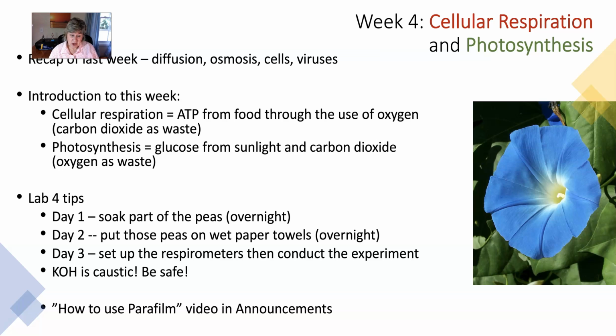Potassium hydroxide is caustic. You need to be careful with it. You need to be safe. So follow all the safety measures. Wear your gloves, wear your goggles. Don't let anybody else in your room when you're doing this. Be careful with the waste cleanup. So just be cautious with this.